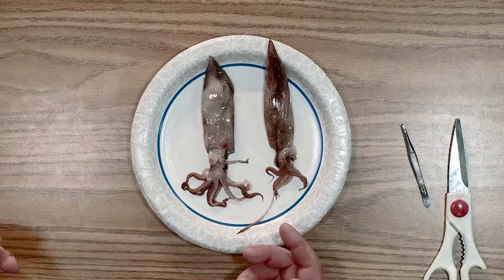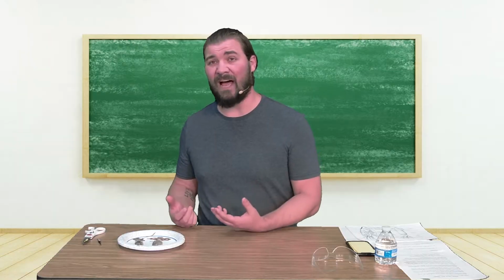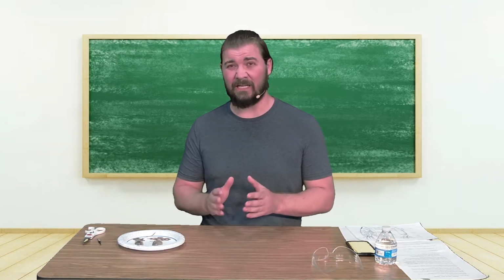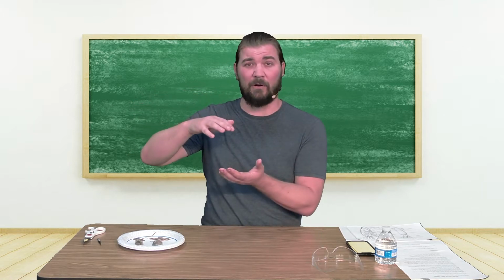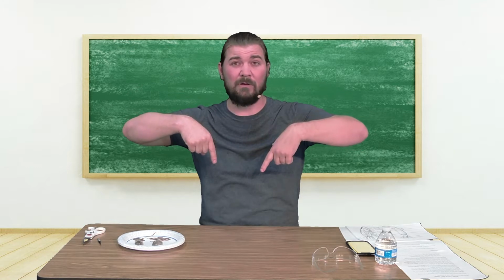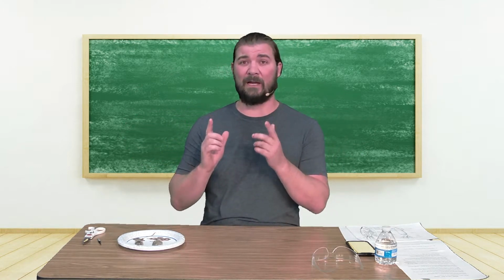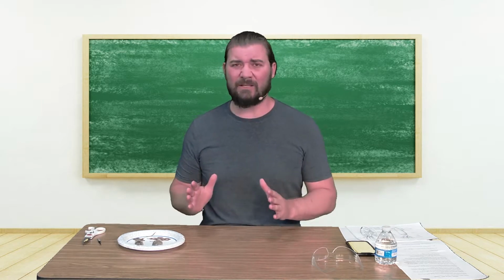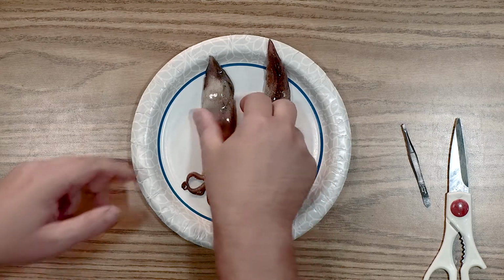This is a natural thing that a lot of creatures in the sea have developed to help them survive. This is called countershading, and that's when the top part is a different color than the bottom part. So one of them is camouflaging for things that are looking down, and the other part of the organism is camouflage for things that are looking up at it. So awesome natural defense.